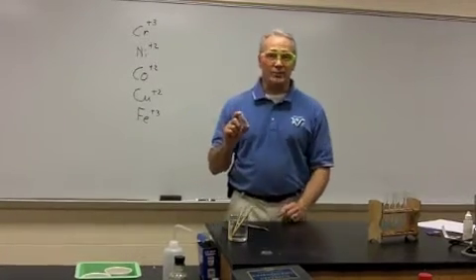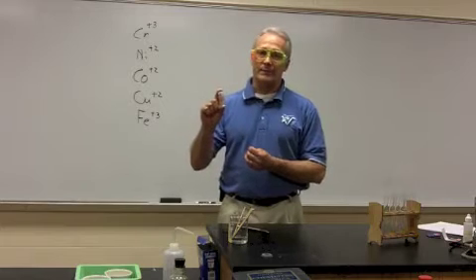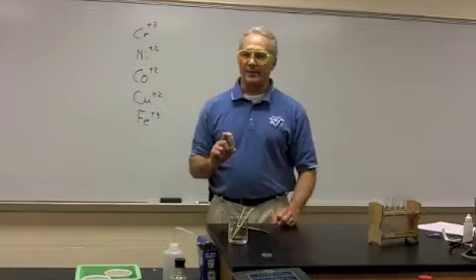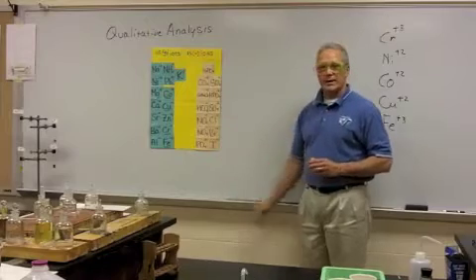Each of you will work individually. It's a laboratory scenario where you work all year this way. There are 7 tests that you're going to do with each one of these, and you're going to use the 7 tests to determine what your compound is. The ions that make up the compounds are 15 positives and 13 negatives.